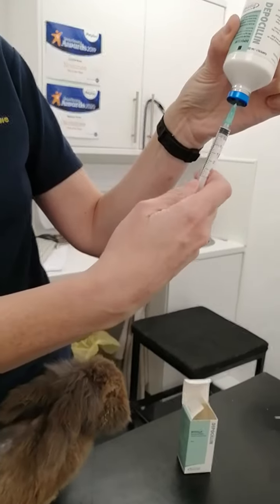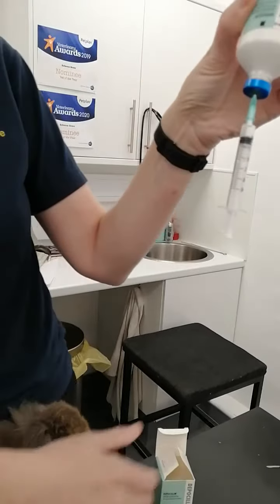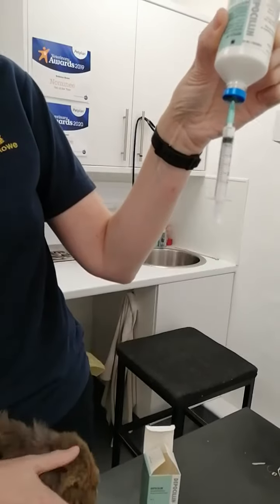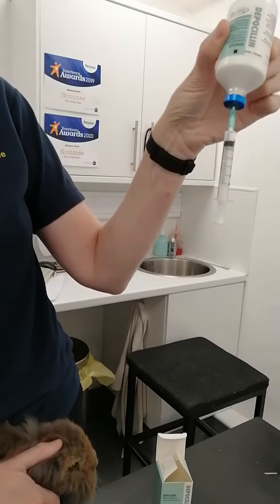Then you can just pull backwards to your required dosage, which in this instance is going to be half a mil. As you saw, I pulled well backwards and then pushed out any bubbles, which will rise to the top. You're not going to kill them by injecting bubbles under the skin, but it just makes it more accurate.